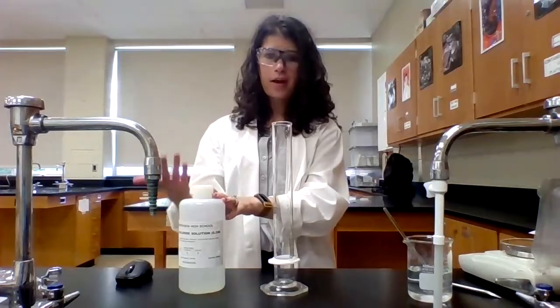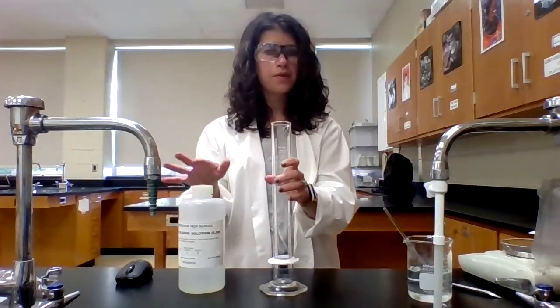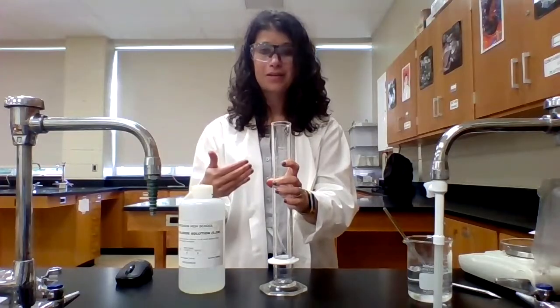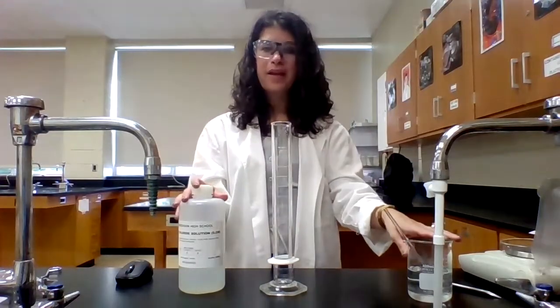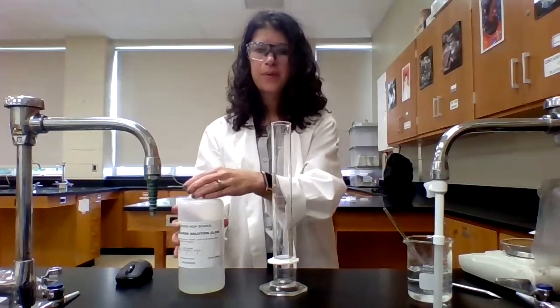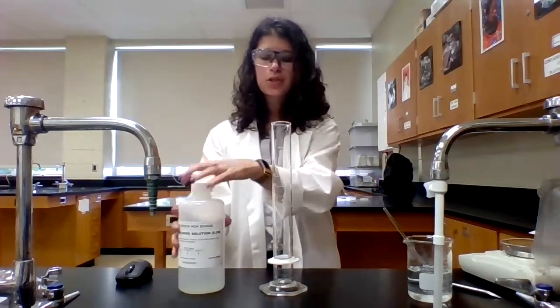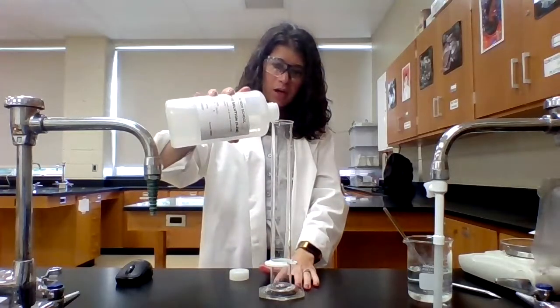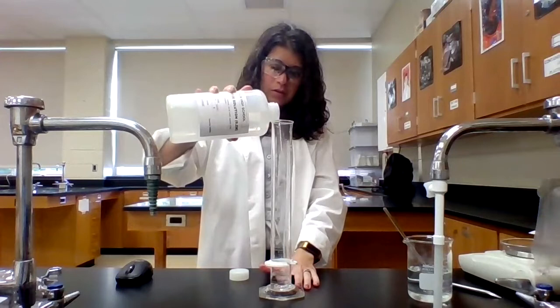That's why I'm not using a burette or a pipette. A graduated cylinder is perfectly fine here because the calcium chloride is going to be added in excess. The unknown carbonate, that's our limiting reagent. That's why we really needed that very precise mass. But the calcium chloride solution, I'm adding in excess because I want to drive this reaction to completion. So I'm going to measure out 125 milliliters.